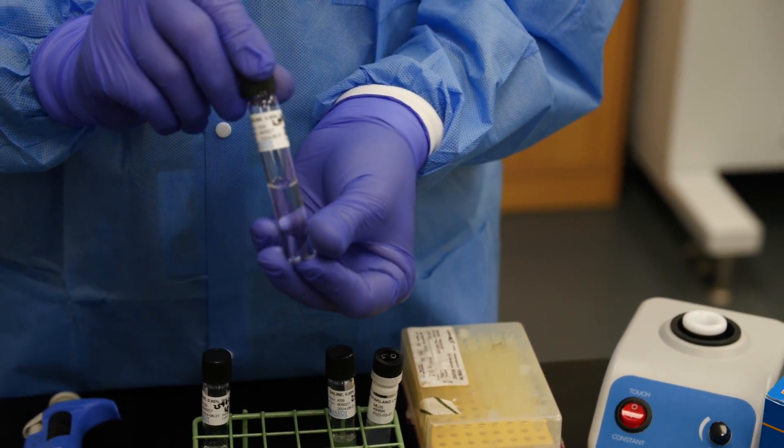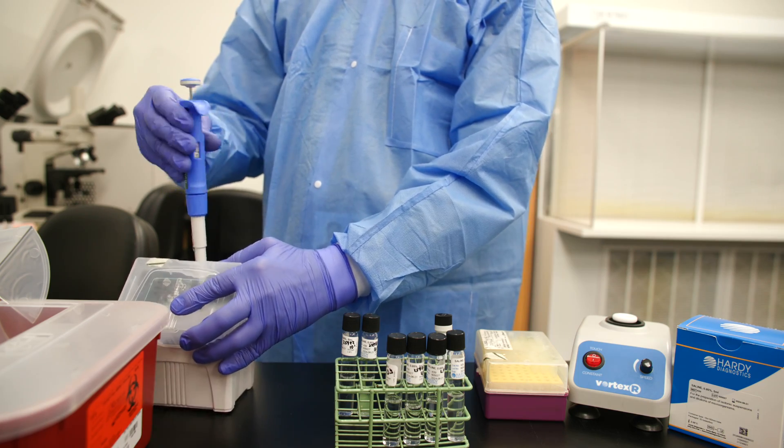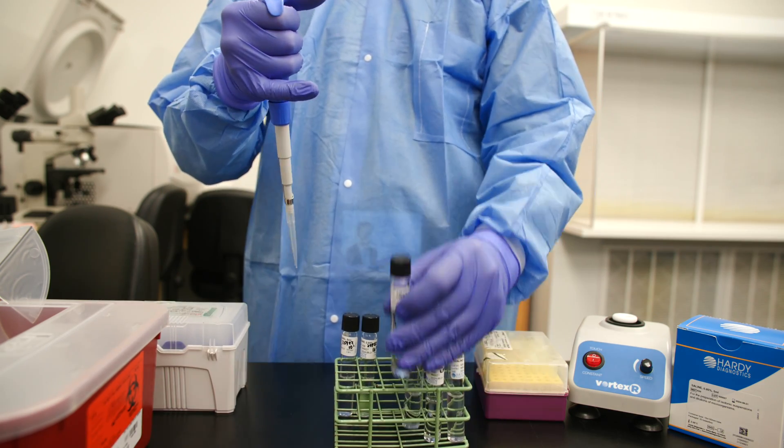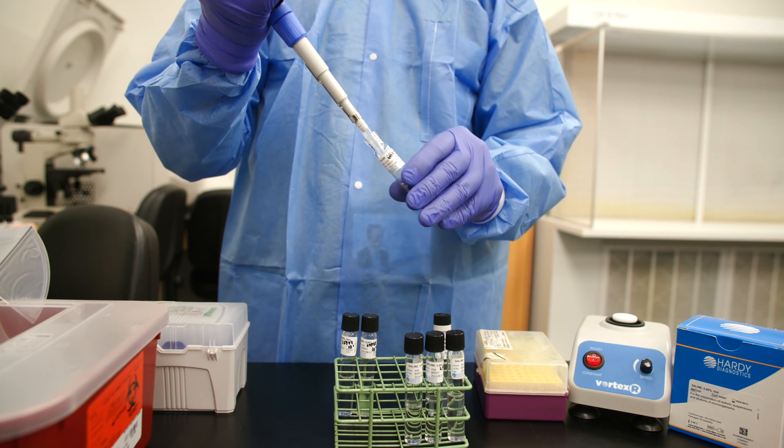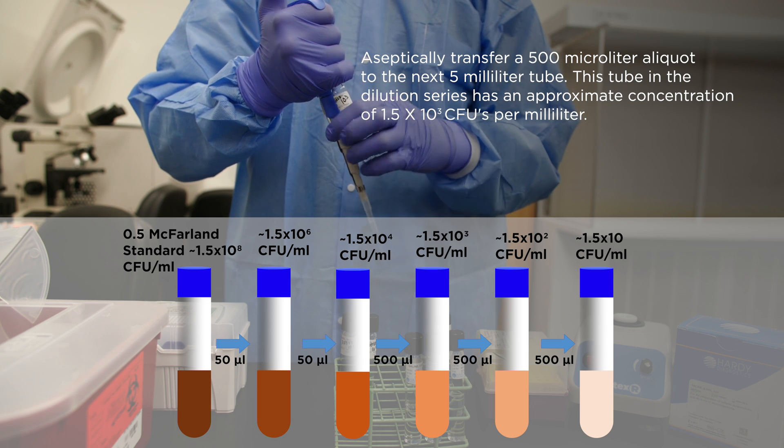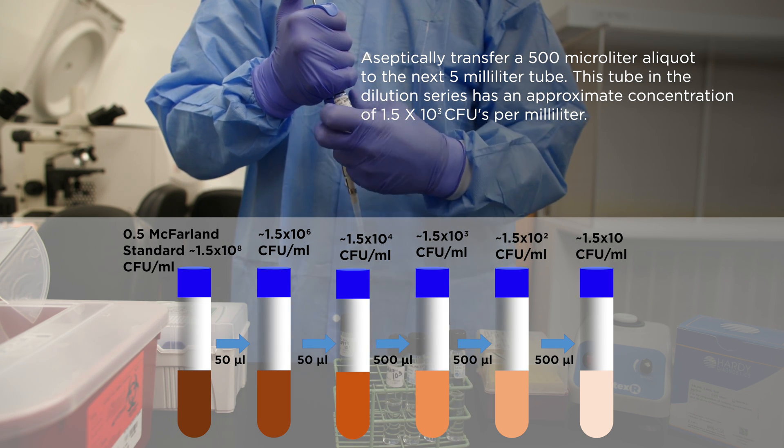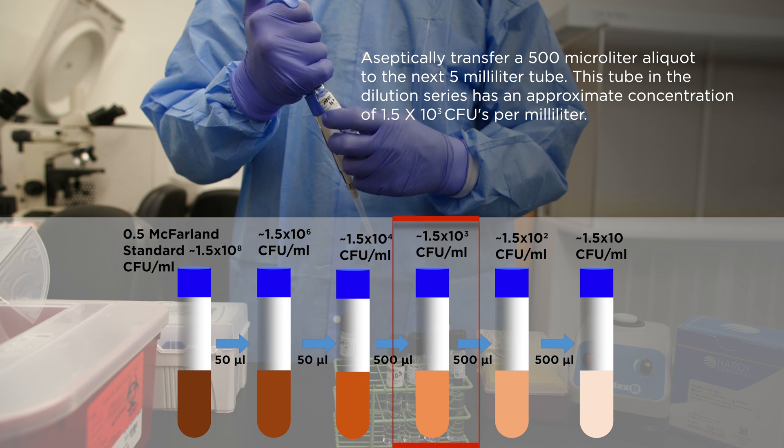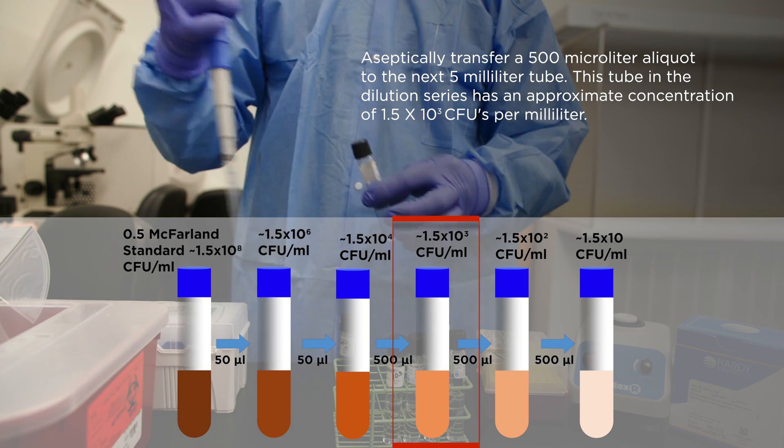For the next three tubes in this example, we will reduce the concentration by 10 fold, rather than 100 fold. Note that since this is a lower dilution factor than the previous example, the aliquot is larger. Aseptically transfer a 500 microliter aliquot to the next 5 milliliter tube. This tube in the dilution series has an approximate concentration of 1.5 times 10 to the 3rd CFUs per milliliter.